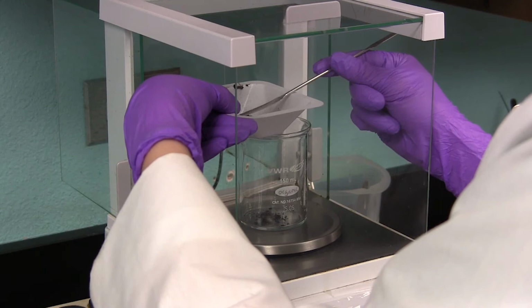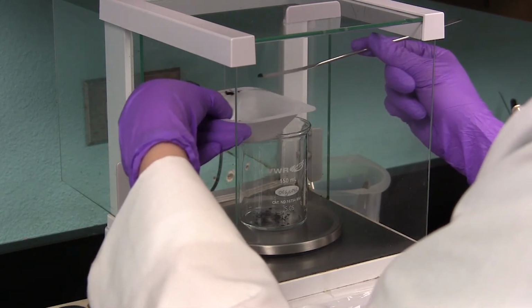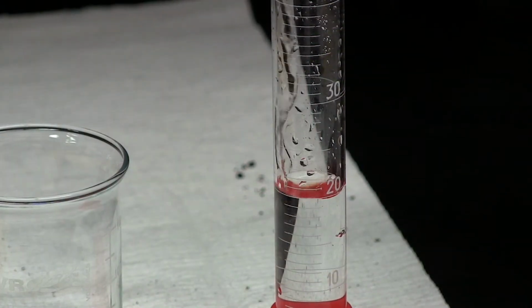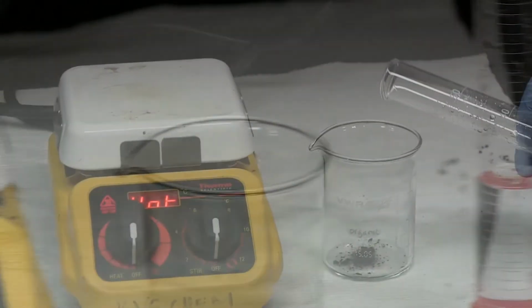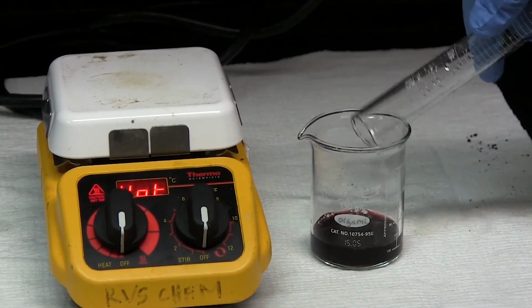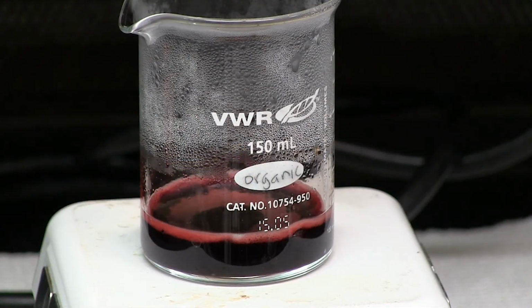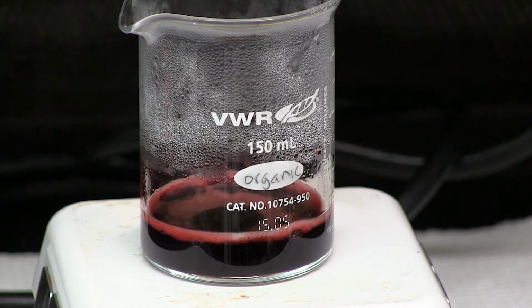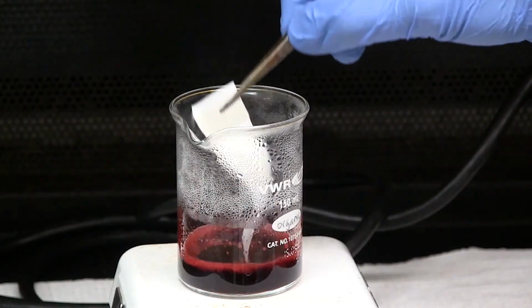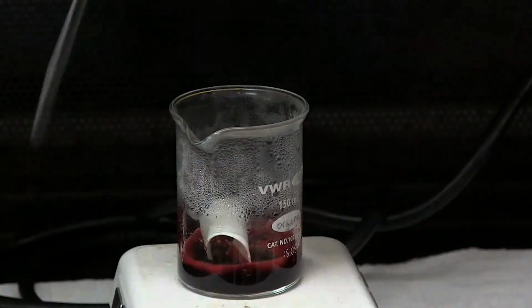You will be given a rectangular piece of cloth that contains a number of different strips of fabric. Prepare the dye bath by mixing 50 milligrams of your dye with 20 milliliters of water in a 150 milliliter beaker. Heat the mixture on a hot plate to the boiling point. Immerse a piece of the test fabric in the bath and use the glass rod to keep it submerged in the boiling mixture for exactly 10 minutes.